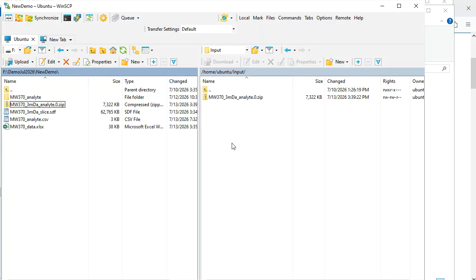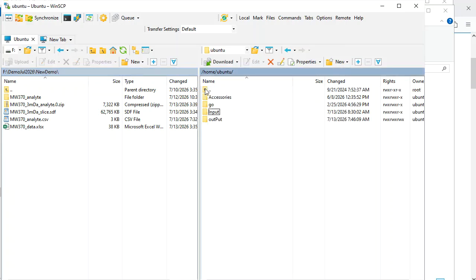Now this is going to take, I've run this before, it'll take 47 minutes to run. So what I've done is, like on a baking show, I've already got one ready to pop out of the oven. So here we are.